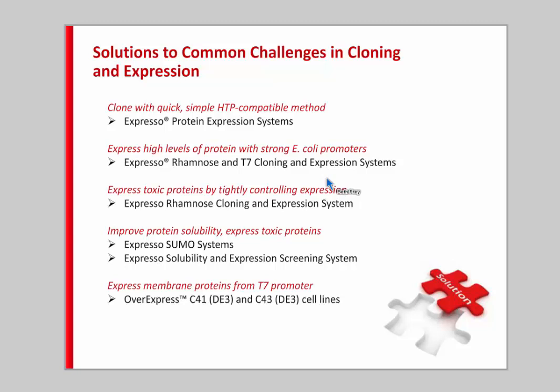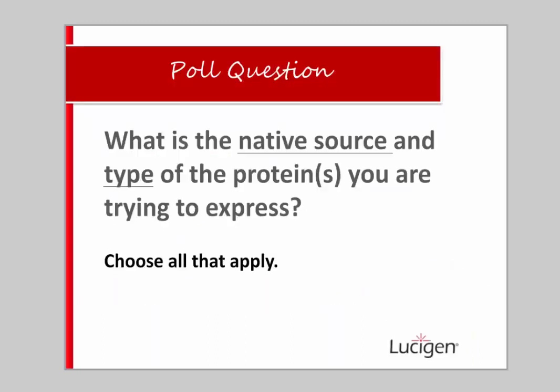And we'll also talk about a solution for successfully expressing membrane proteins in E. coli, which, as you know, membrane proteins are a particularly difficult class of protein to express in a prokaryotic system. And that overview will bring us to our first poll question.